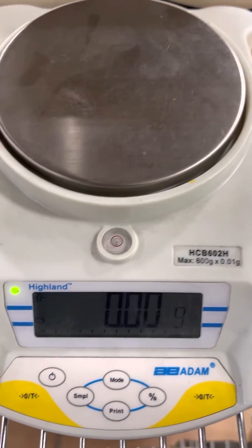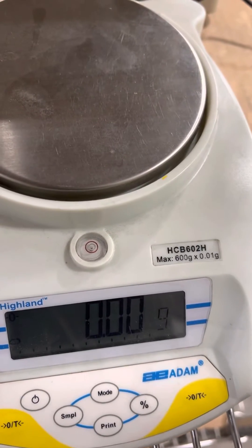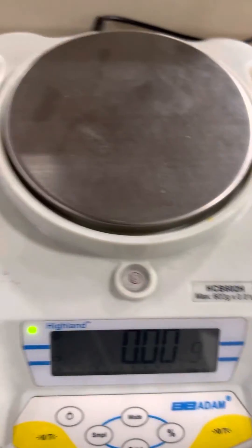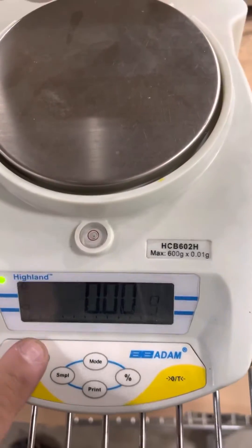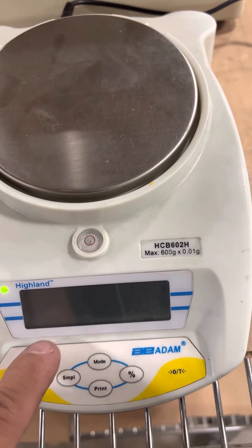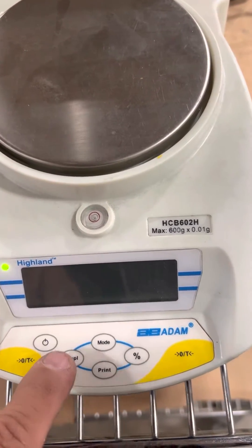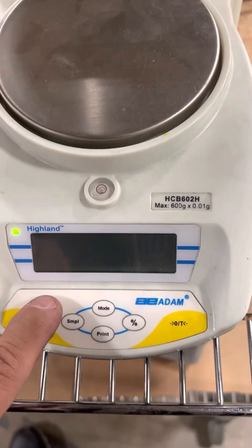This is a calibration adjustment of an Adam Highland series, or HCB602. Basically, you turn it off, and when you turn it back on, as soon as it goes into diagnostic countdown, you press the sample and the print at the same time.